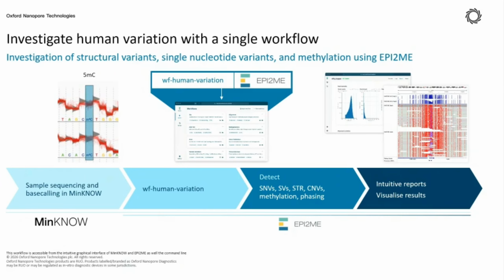That means based on the reads, as long as the variants come from the same single DNA molecule, we are assuming we will be putting them into the same haplotype. So in that case, we are able to separate out different alleles by their haplotypes. So this is one of the very good benefits of using long-read sequencing.